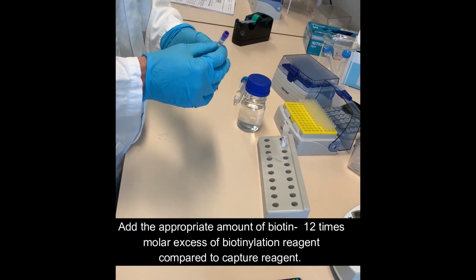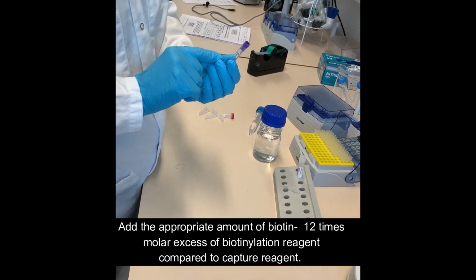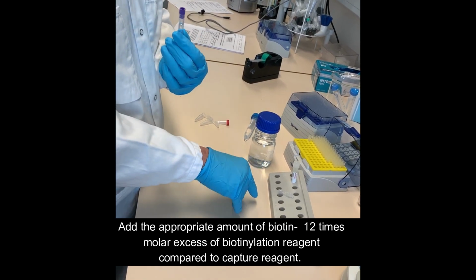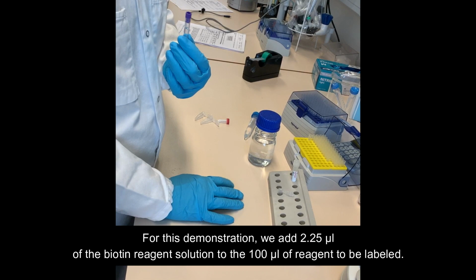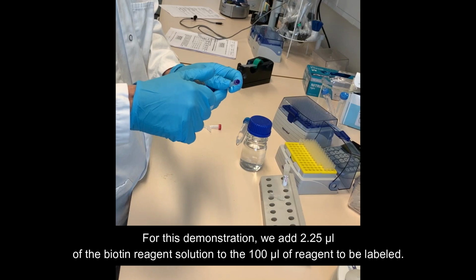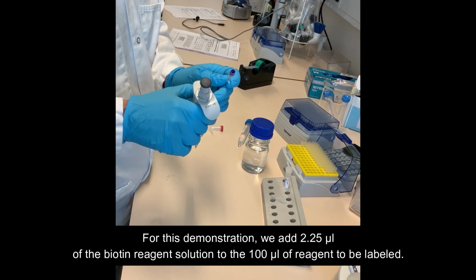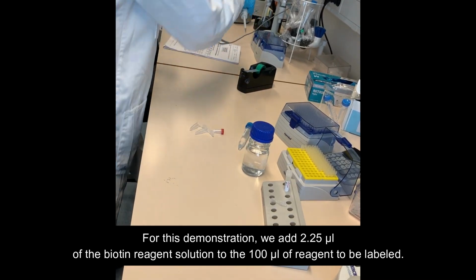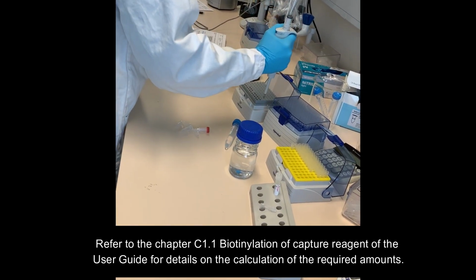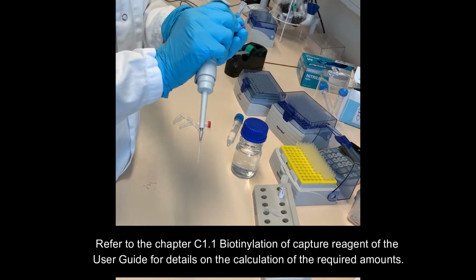Add the appropriate amount of biotin. 12 times molar excess of biotinylation reagent compared to the capture reagent will be needed. For this demonstration, we added 2.25 microliters of the biotin reagent solution to the 100 microliters of reagent to be labeled. Refer to Chapter C1.1 Biotinylation of Capture Reagent of the User Guide for details on the calculation of the required amounts.